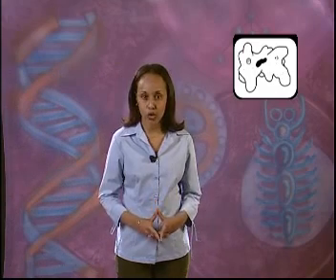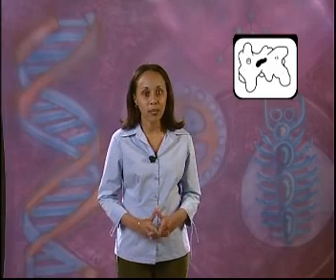Well, I am sure you all enjoyed the drawing in this lesson. And by now, you should all know how to use the microscope and how to make a slide. You should also have an idea of what plant and animal cells look like.